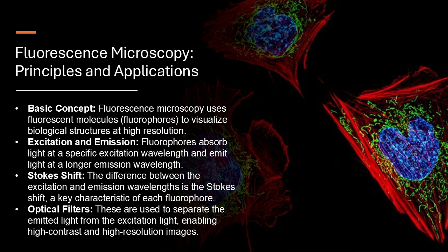Yeah. It reminds me of how the discovery of the Stokes shift, that difference in color, was a pivotal moment in the development of fluorescence microscopy. Oh, wow. It was like scientists suddenly had a way to decipher the language of these tiny beacons. I can only imagine the excitement when that discovery was made. Like they stumbled upon a secret code that unlocked a whole new world of understanding. Absolutely. And we've come so far since then, with even more advanced techniques like confocal and multi-photon microscopy. What's next? What does the future of fluorescence microscopy hold?